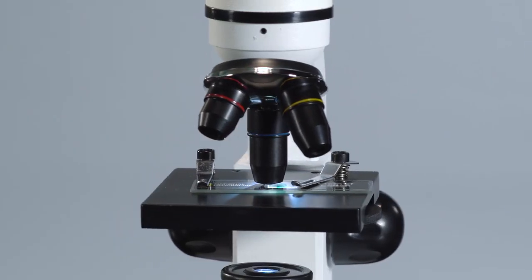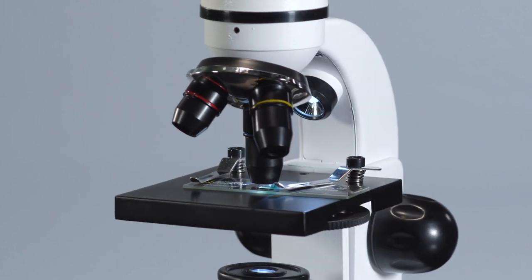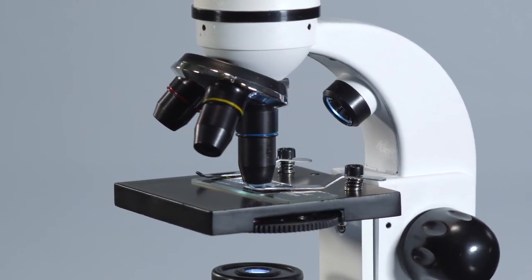Able to accommodate different types of specimens, this microscope offers both top and bottom illumination and an adjustable color filter wheel.